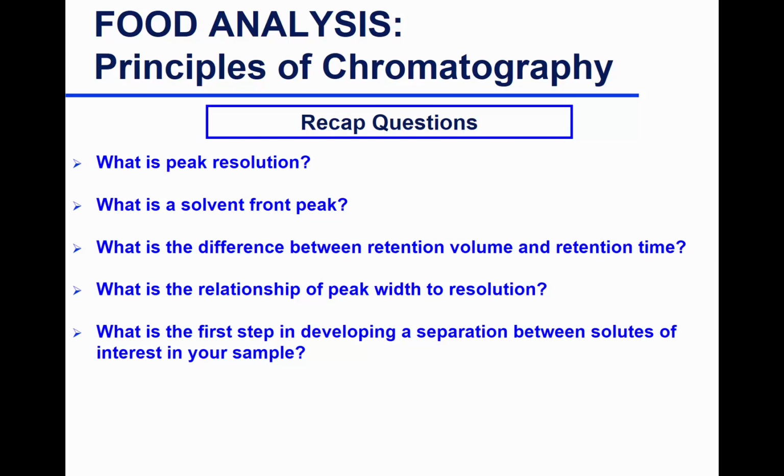In gas chromatography, start with a nonpolar stationary phase. In liquid chromatography, try to hypothesize what the compounds are. You think are going to be polar, nonpolar. You can start somewhere with a stationary phase and a mobile phase and go from there.